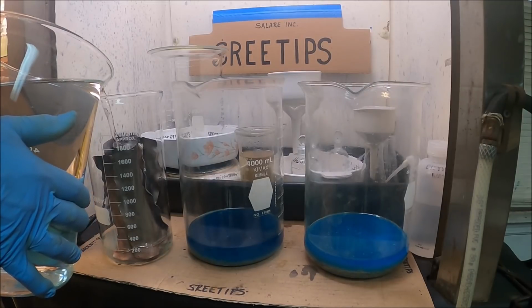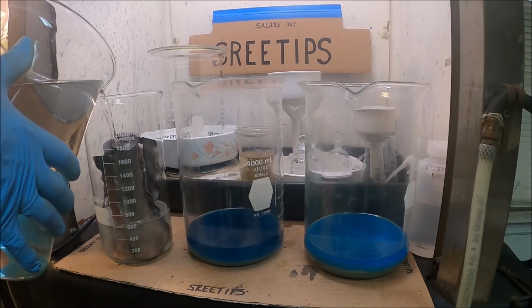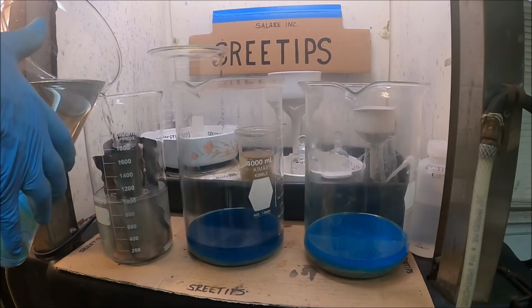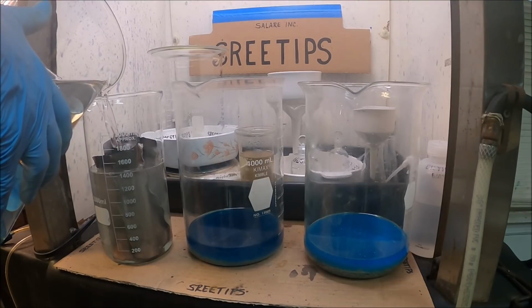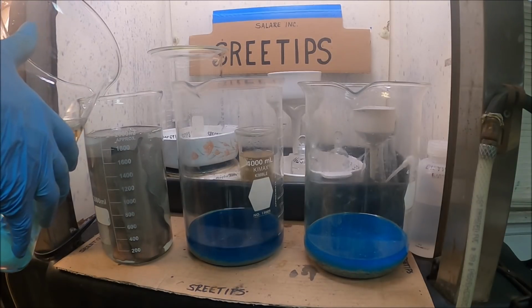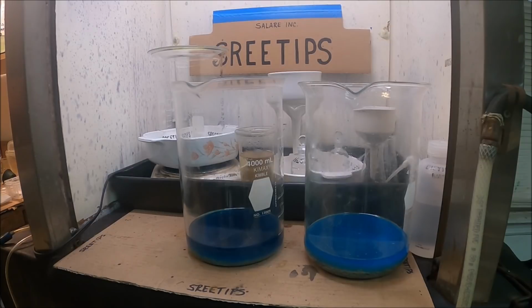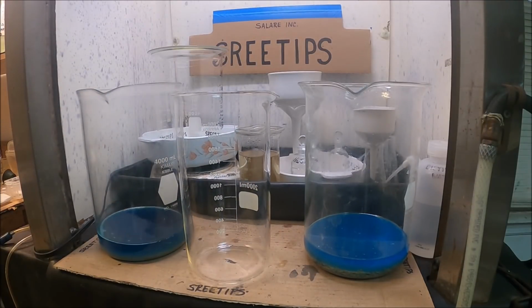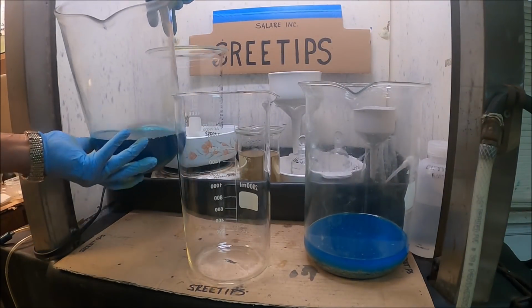What I'll do is just cover these pieces of copper with this water, and a little bit of silver will come out of solution from this. There's a little bit of silver in this water that I'm pouring into the copper right now. As I said, I do not want the copper exposed to the air. It'll form a green copper oxide if you leave it out in the air. All right, I'm gonna move this out of the way now. And now what we'll do is I'm gonna transfer the silver that we recovered from this process into this jar here so we can take a look and see what we got.